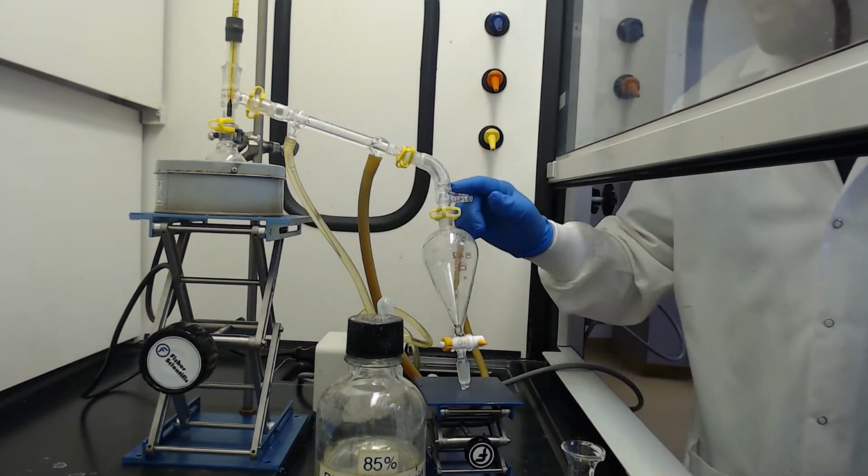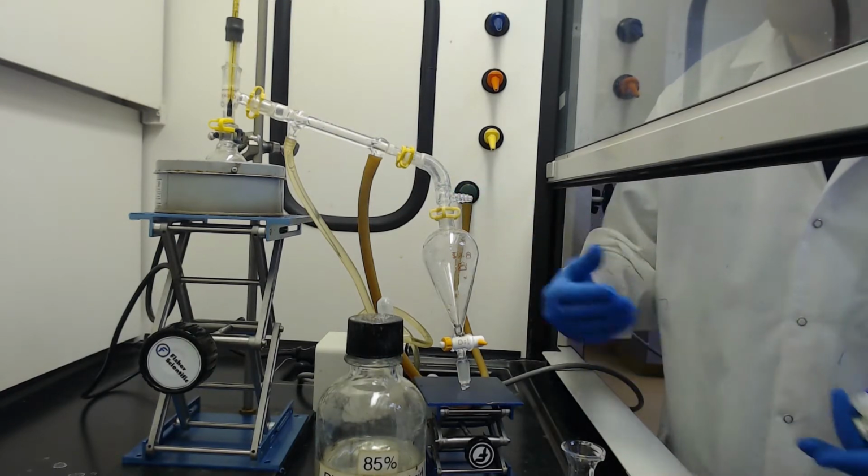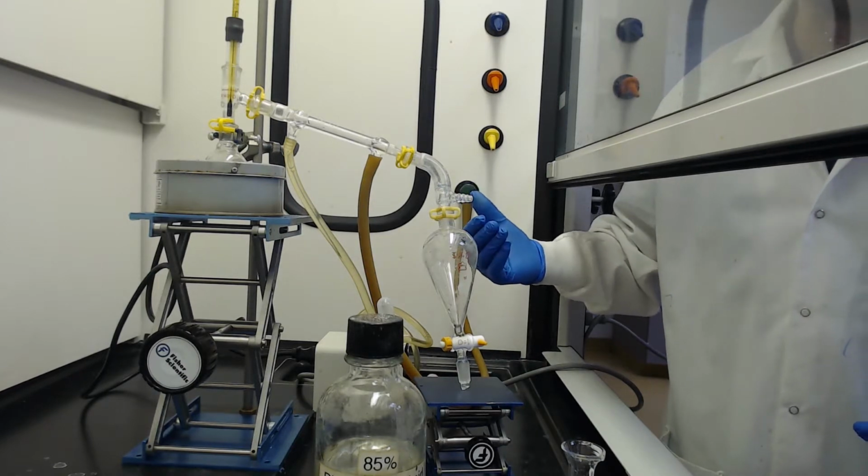It's real important here that this is where this system is vented. We're about to heat it up, so we're going to create pressure, and if we don't have this vented to the air, we're going to have issues.